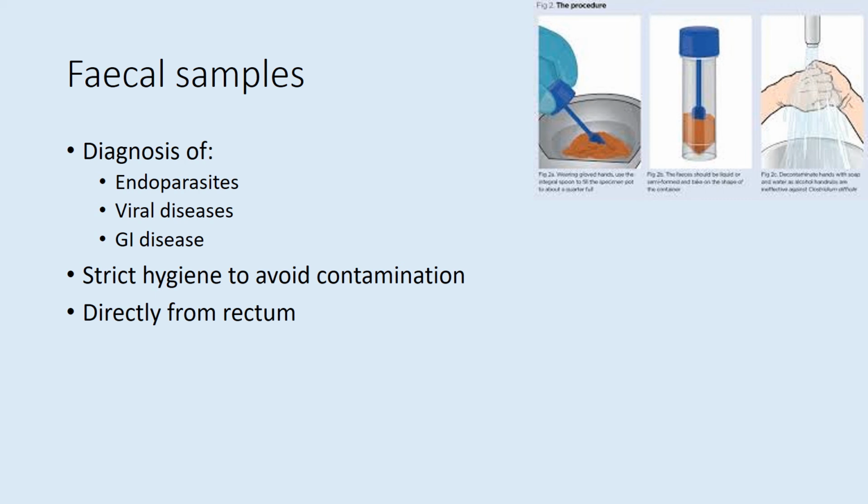Now, direct rectal fecal sampling is very useful if you have animals that are housed in groups, so that you know exactly which animal that is from, okay? Because if you've got, for example, a horse in a field with multiple horses in it, you don't necessarily know which one it is that has passed the feces. So if we need to make sure that we know who it's from, then this is one of the methods we can use.